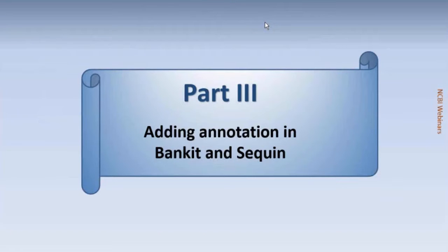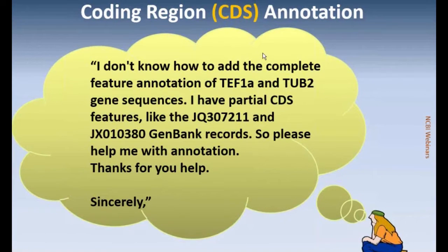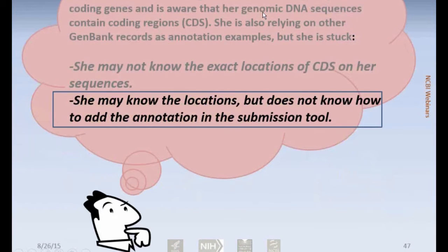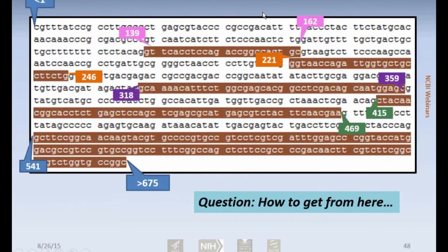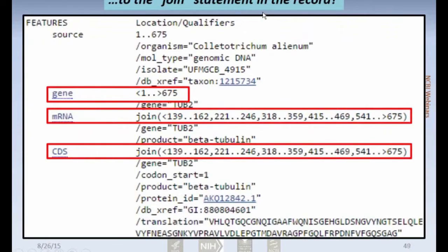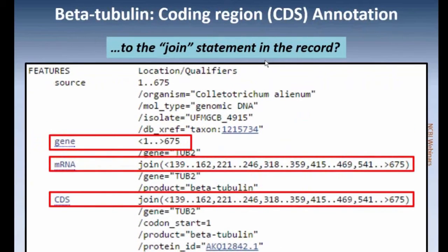Now let's talk for a few minutes about how you actually add the annotation in the two submission tools. Our submitter needs help with how to do it in the submission tool. This is their beta-tubulin sequence with the exons highlighted, and what we want to do is get from this with the specific nucleotide numbers to the features that we see in a GenBank display record.